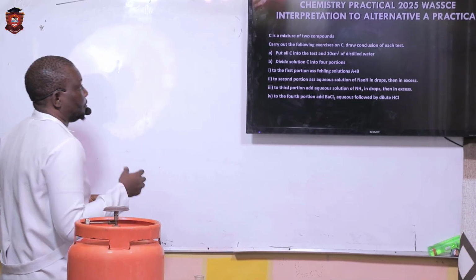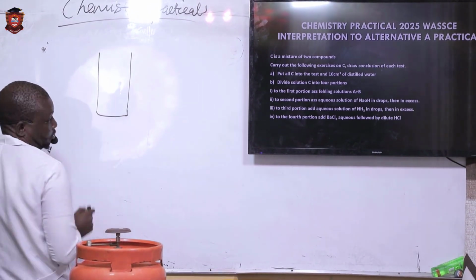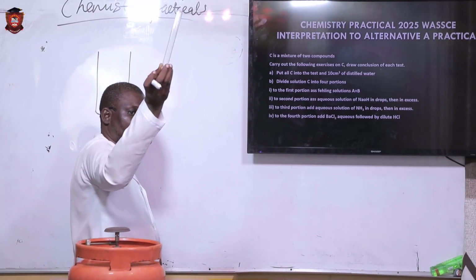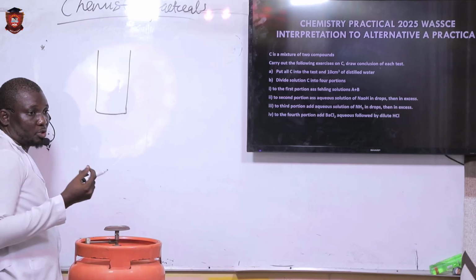Okay, now for me, I always say that we have a very big long. Let's make it very long. This is your boiling tube, your test tube, your first part of the test tube here. I think I'm going to use this first, because I think we'll be requiring boiling. So we have this. So now you're going to be asked to put some sample.